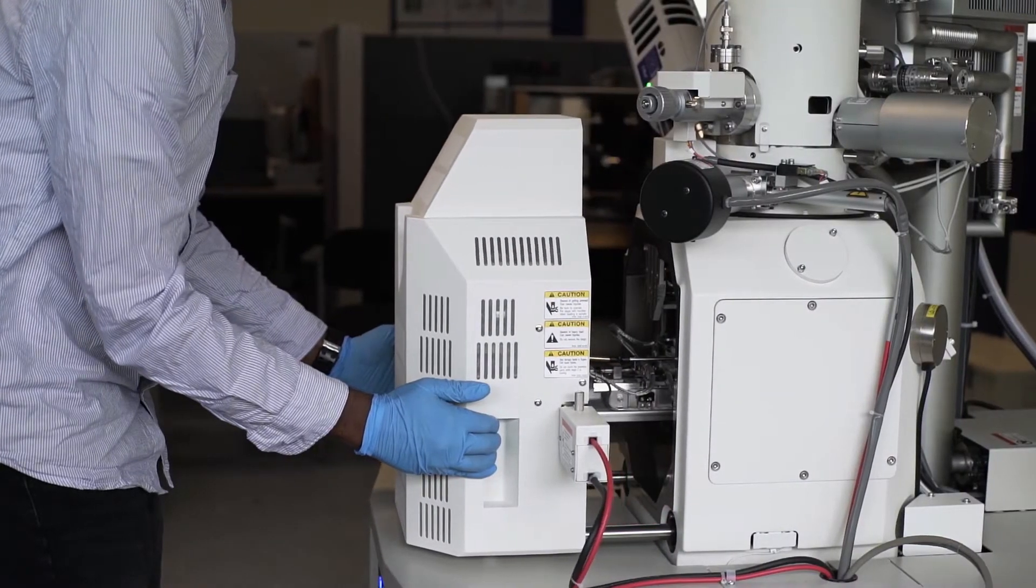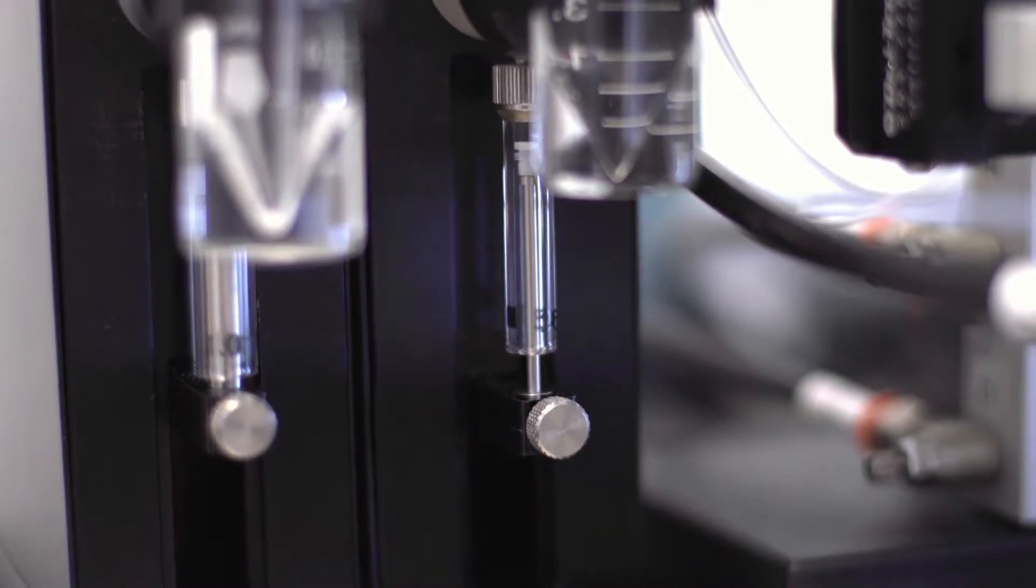Stress testing, TGI analysis, a fine cell biology laboratory, lots of electronics and software engineering type laboratories.